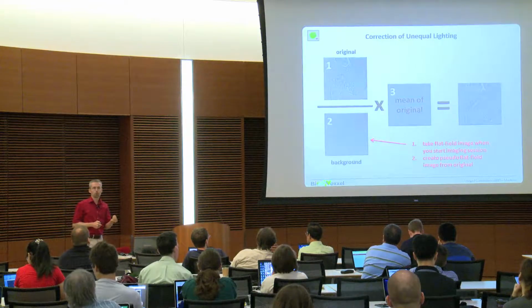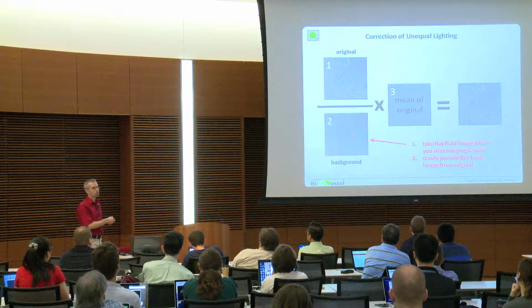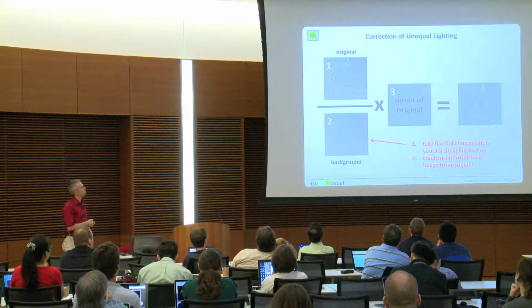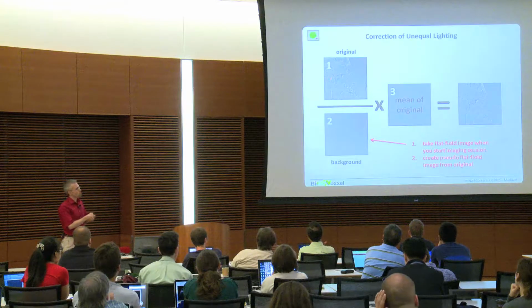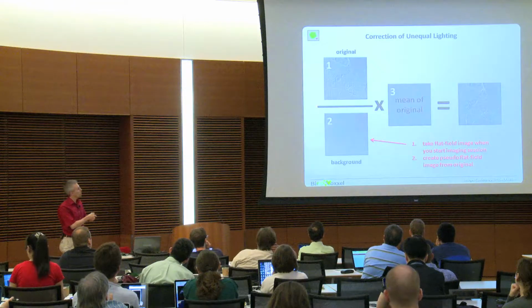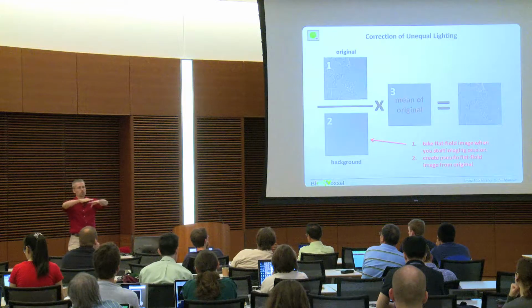This is the optimum. So if you directly, before you do your imaging, you take one image without any sample, just in the lighting conditions you have. If your microscope still, even after setting it up correctly, has any problem with the lighting, what this function actually does is it uses that background image and divides the original by that background image. So you can imagine wherever you have dark areas, so low values, and bright areas, so high values, you divide low values by a lower value and high values by a higher value. This means basically what you do is you level that on a similar level.